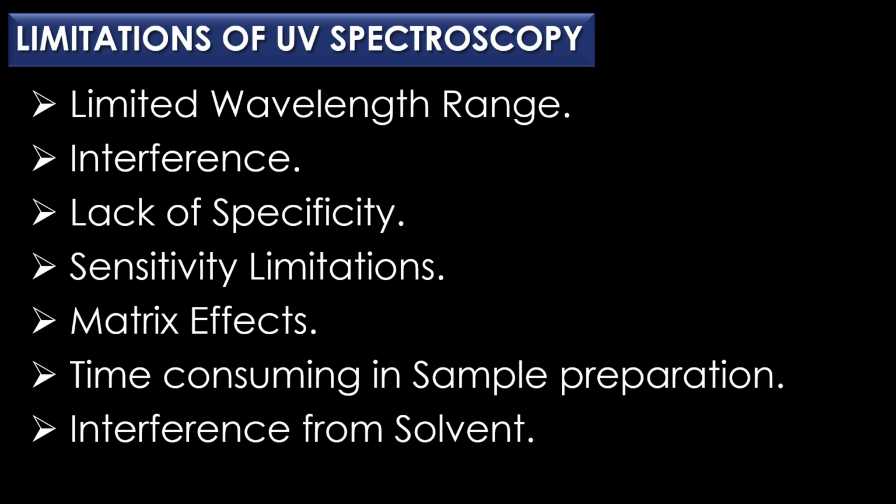It is important to be aware of these limitations when considering the use of UV spectroscopy for a particular application. In some cases, other analytical techniques may be more suitable or can be used in combination with UV spectroscopy to overcome its limitations.